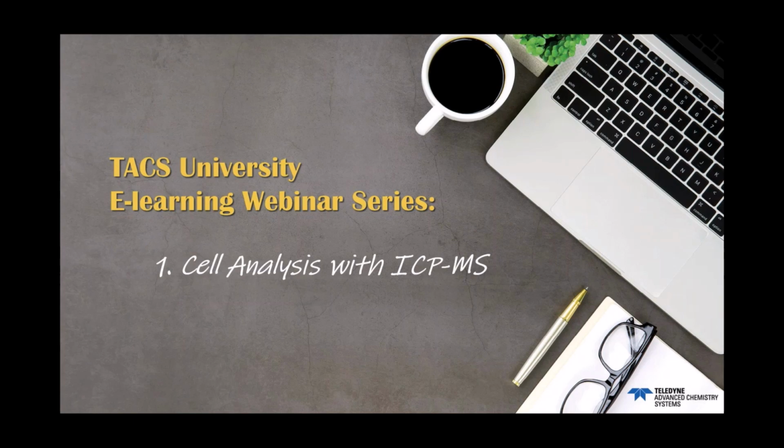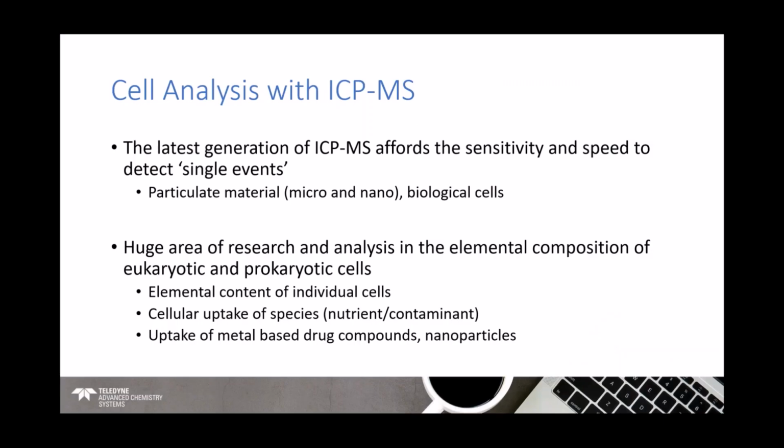I've been involved in ICP-MS for around about 20 years now, as have a number of our colleagues, and in that time period, a lot has happened in trace element analysis, particularly with ICP-MS instrumentation. ICP-MS instrumentation today is considerably more sensitive, more robust, faster, the instruments are smaller, and it's capable of so much more than it was 10, 20 years ago.